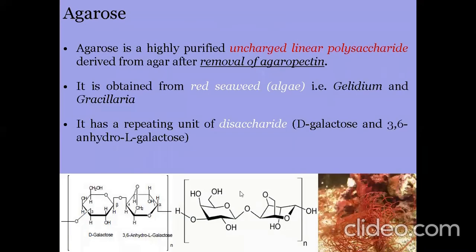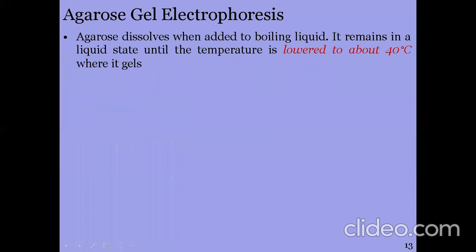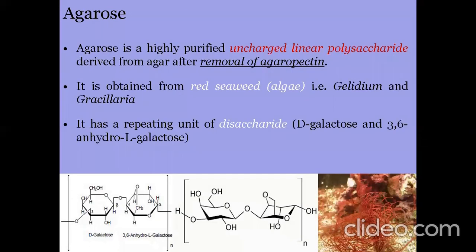And after that, these are two different representations of the same thing. And agarose gel electrophoresis, so who will explain, so that we have a basis for the further explanations? Sir, shall I? Yes, please.